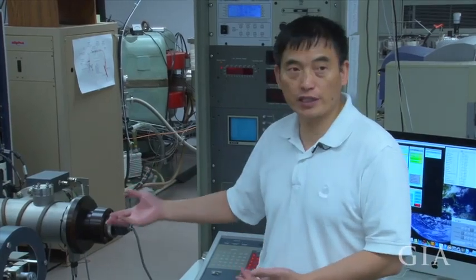If you want to measure carbon isotopes and nitrogen isotopes using this machine, you have to use two different sessions. Nitrogen is a trace element in diamond and carbon is a major element. You have a lot of carbon signal, so you do carbon isotopes in one session and measure nitrogen isotopes and nitrogen concentration in a different session.